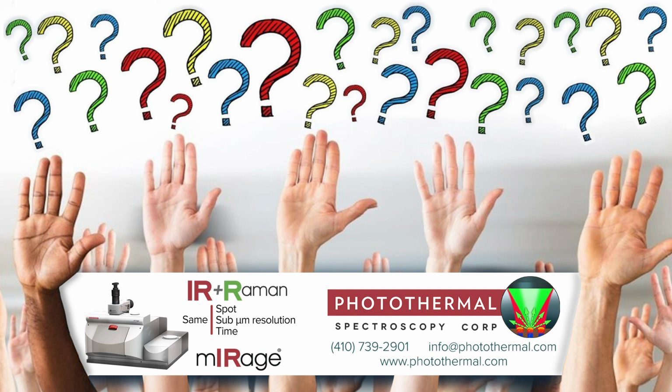No. Nothing. Well, of course, we have to calibrate not only the intensity axis of the Raman system, you have to calibrate also the wave number axis of the Raman system. And I used the Raman spectrum of polystyrene for the wave number calibration.